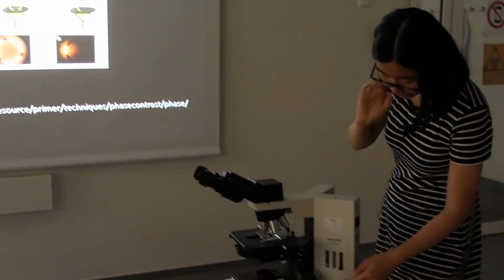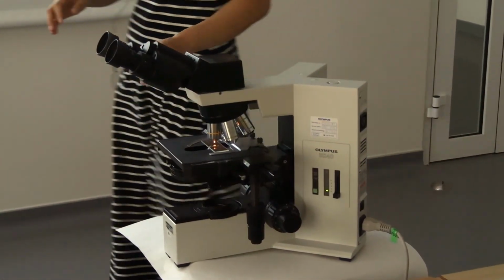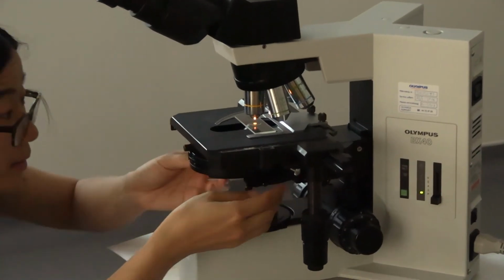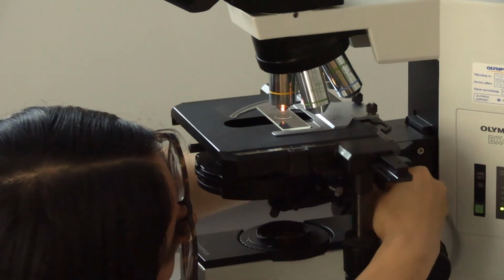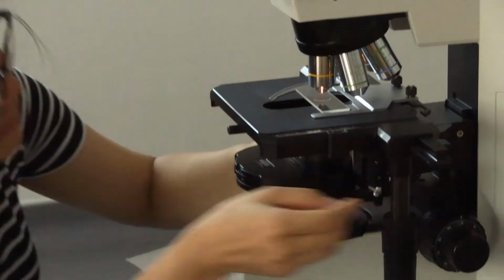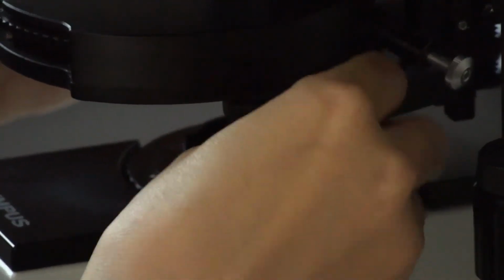I will show you what is really located inside. So here I need to take out the condenser. So when you work on your exercise, don't do that by yourself.